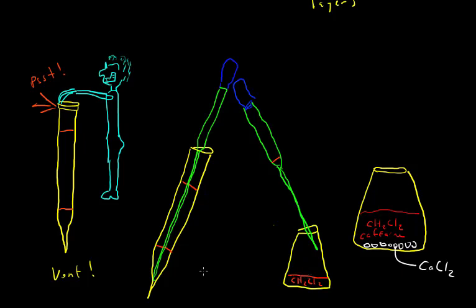It's probably better to leave a little bit of dichloromethane behind than to try to get all of it and contaminate the dichloromethane with the aqueous phase. So it's okay if you leave a tiny bit behind, because remember, you're extracting 3 times anyway, so you're going to be adding more dichloromethane. Once you separate the dichloromethane, you add 2 more milliliters, cap it, and repeat the process. You do that 3 times.